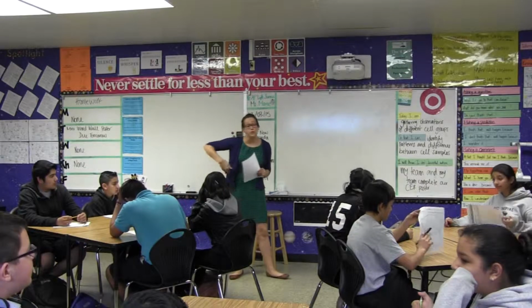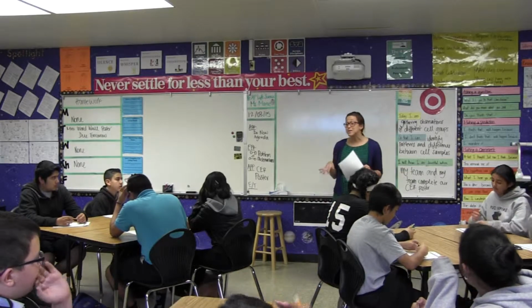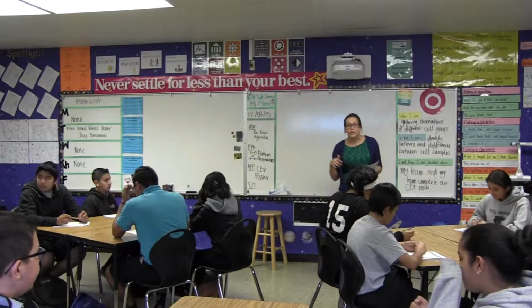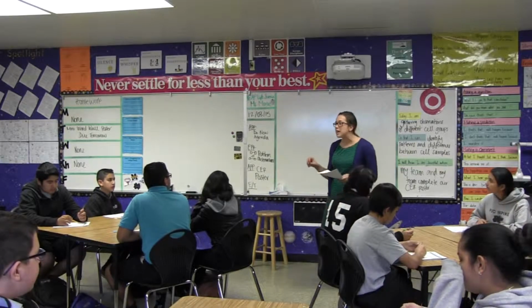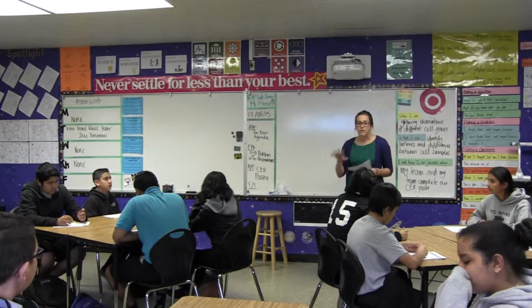So you're going to be working first with partners, and we're going to be really digging into different types of cells. You may have had some experience before with cells, and that's great. Use your prior knowledge. But we're really going to be looking closely at some samples, and your goal is to identify what kind of cells are the mystery cells.